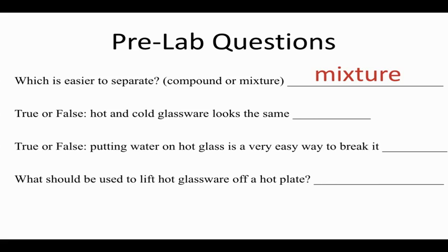Now let's make sure we're prepared for the safety procedures that we need to follow in this lab. Number 2, true or false? Hot and cold glassware looks the same. This is true. We want to approach hot glassware with caution before we touch it.